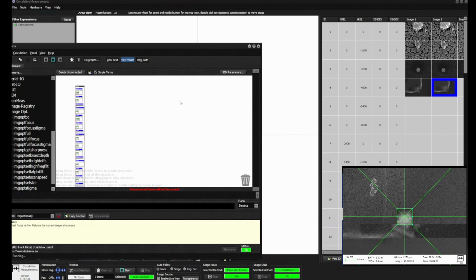Probably cleaning some surface coverage. Okay.